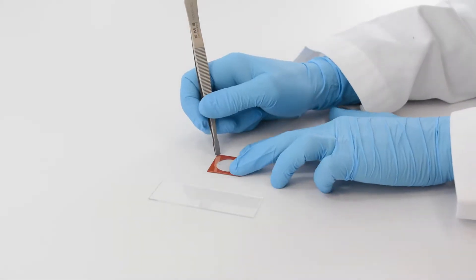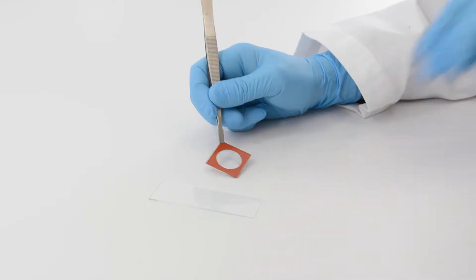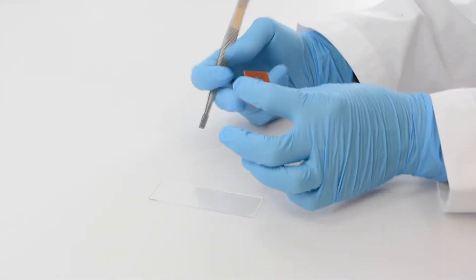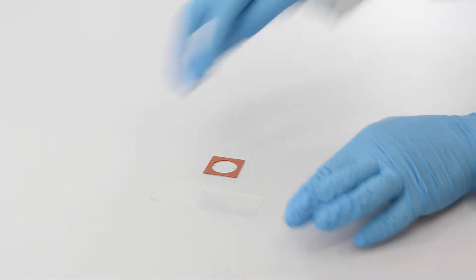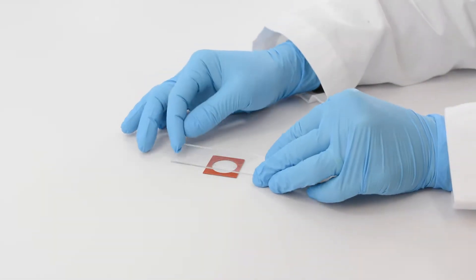To create a chamber, remove the liner from the seal. With the adhesive side up, place the slide over the chamber and press down firmly.